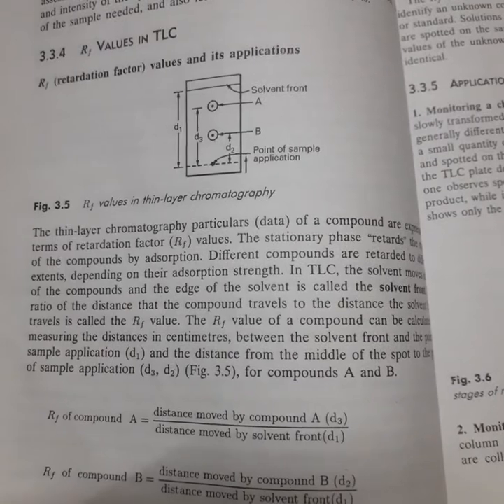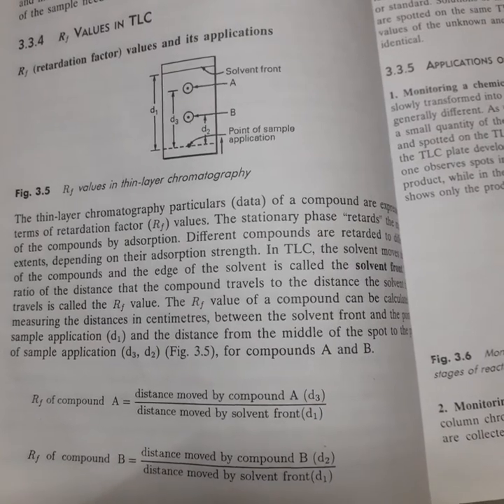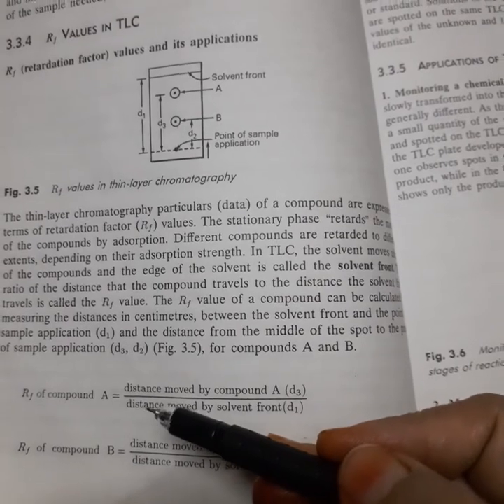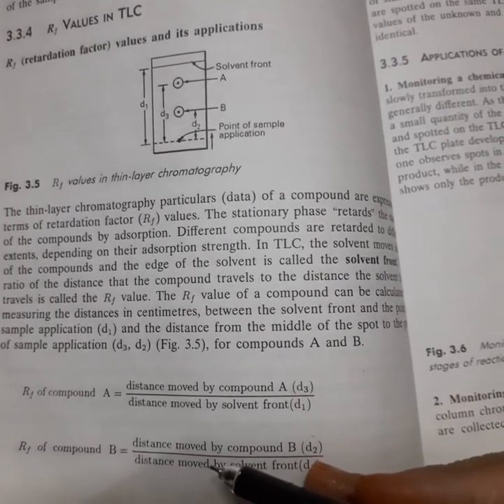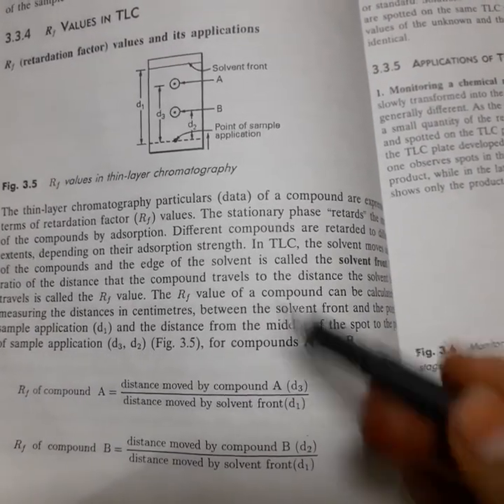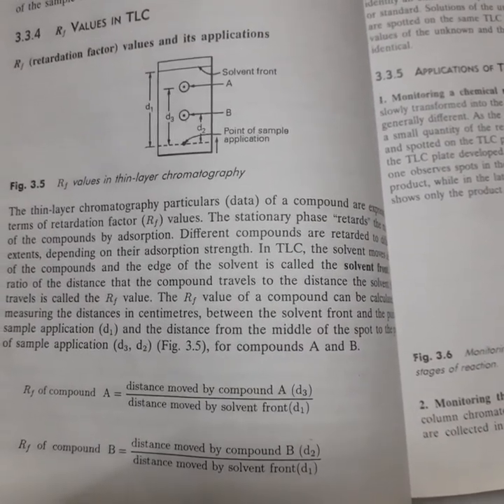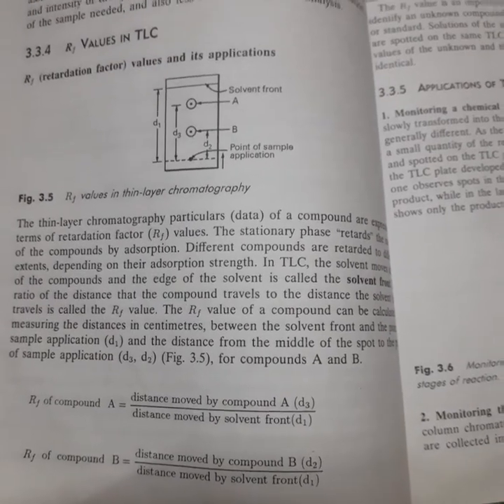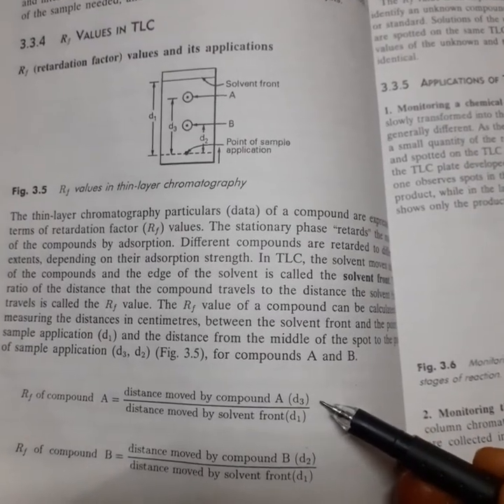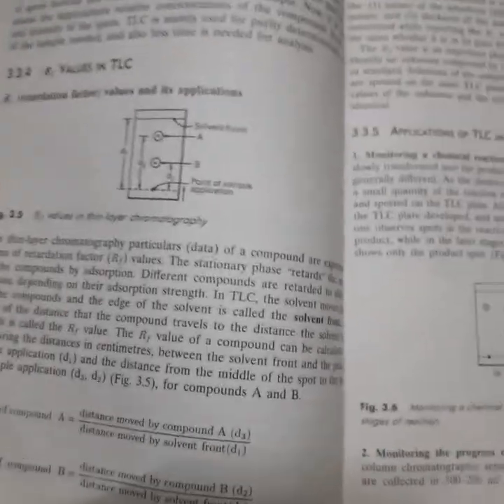Let us take the same example as in column chromatography. Suppose I am separating orthonitroaniline and paranitroaniline by using this TLC. Orthonitroaniline has some RF value, that is a fixed value. Paranitroaniline also has a fixed RF value. So what I got from this experiment, these RF values are compared with the nitroaniline RF values, to see which one it is correlating with. By using that table, we tell that yes, this is orthonitroaniline and this is paranitroaniline.